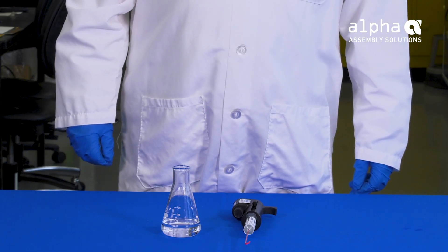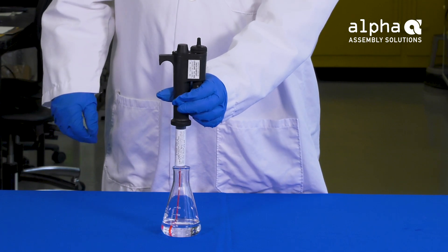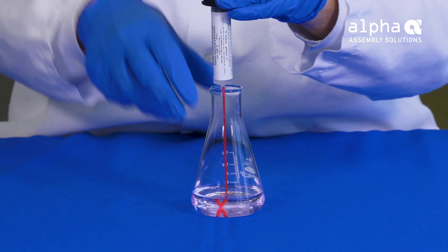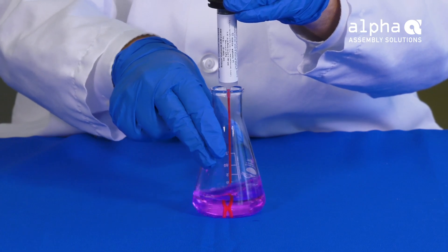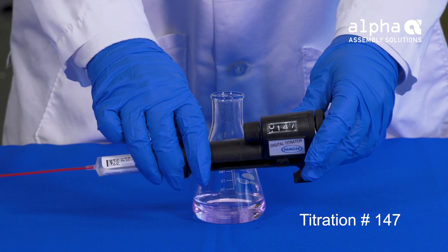After zeroing the reading, immerse the delivery tube into the solution. Titrate by turning the delivery knob to dispense a measured amount of sodium hydroxide. Keep turning the knob and swirling the sample until the solution turns pink in color for at least one minute. Once we obtain the titration number, we can now calculate the acid number of the flux.